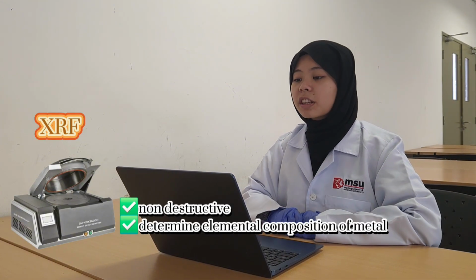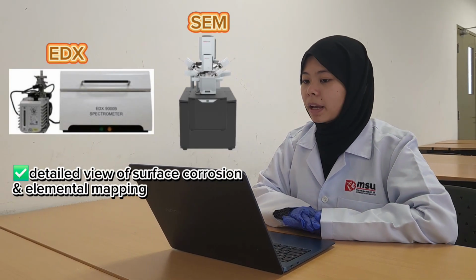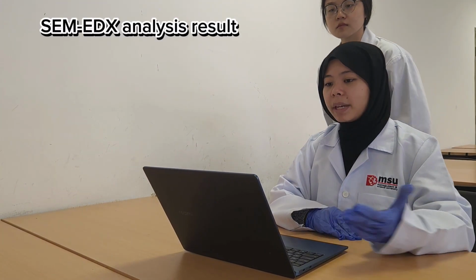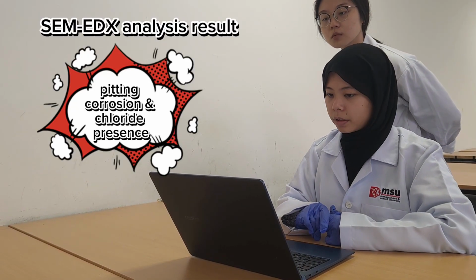XRF is a non-destructive method that can determine the elemental composition of metals. EDX paired with SEM gives a more detailed view of surface corrosion and elemental mapping. I find the tool is primarily made of iron with traces of chromium, likely stainless steel. SEM EDX analysis reveals pitting corrosion and chloride presence, possibly due to exposure to salt water or acidic chemicals.